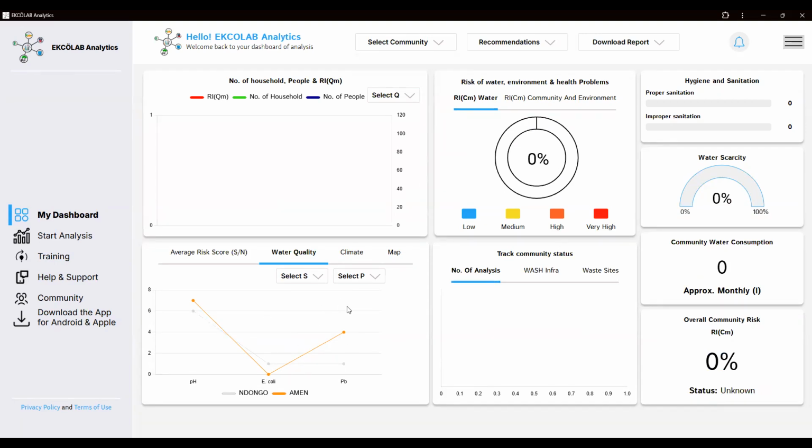During a field experiment, a field analyst can conduct different analyses and decide to take water quality testing at the same time in the field. Our application can solve this problem by not wasting time. Everything can be done automatically while collecting the results. In the field, you directly input your values into the application, and you get your result of the level of contamination of the water source.